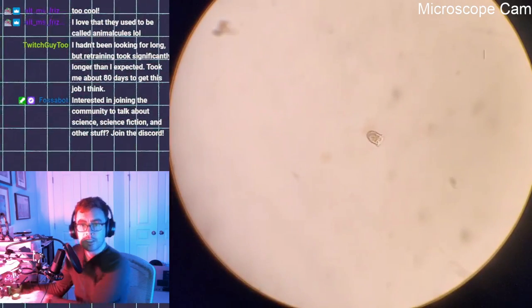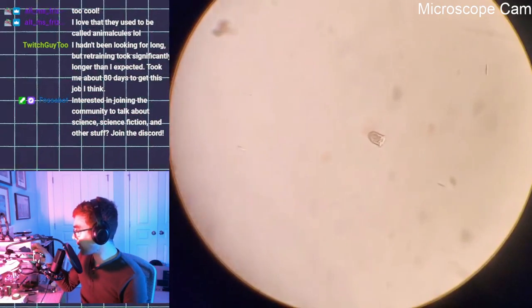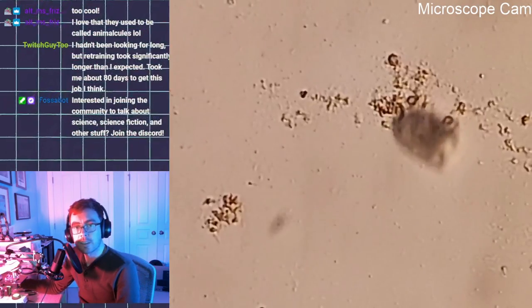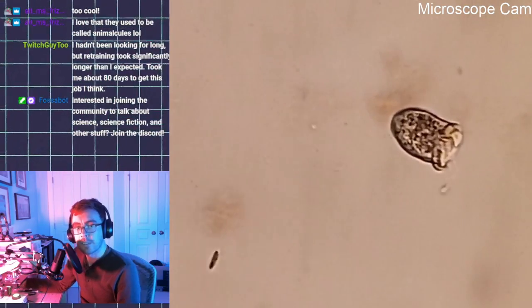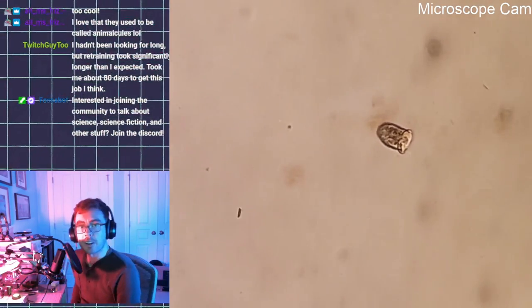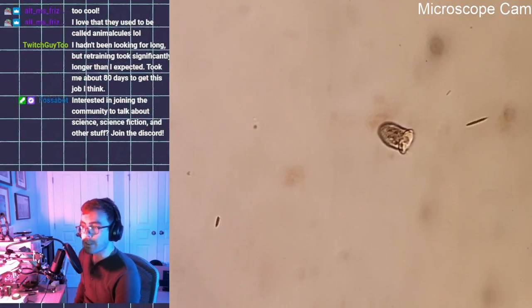Hello. What are you? Are you a lonely vorticella? Yes, you are. Oh, did it attach to the plate? Oh, it did. He's just attached to the plate, in the middle of nowhere. Vorticelling.